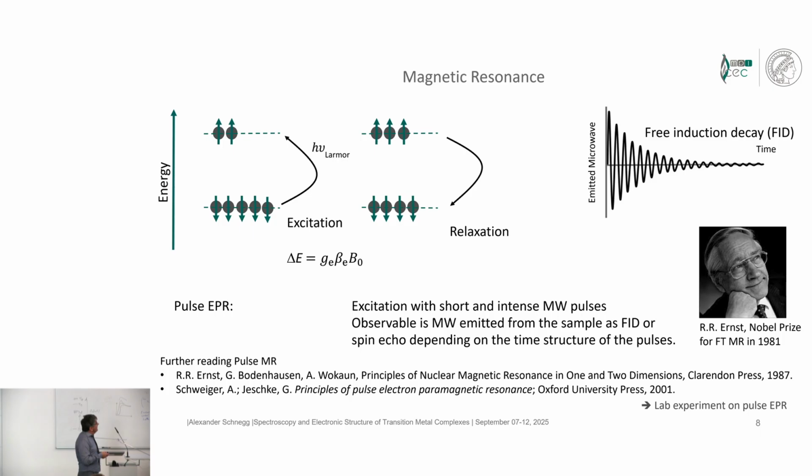It was later also the basis for the development and invention of nuclear magnetic resonance imaging. I don't know if you've ever been exposed to an MRI scanner. There are fields changed in the scanners, but they don't sweep the external magnetic field. It's a pure FID technique, and this would not be possible without FIDs.